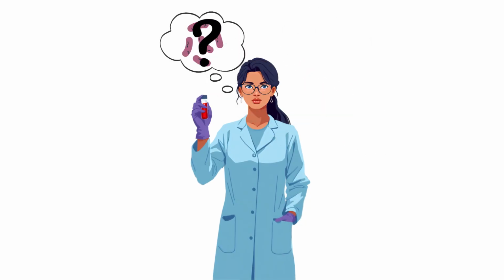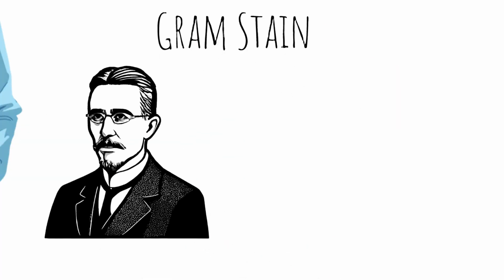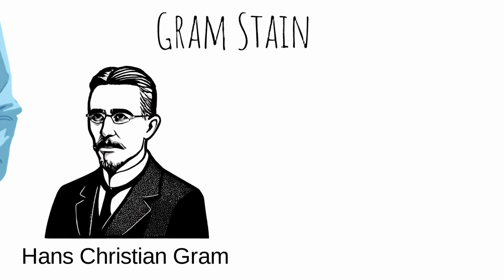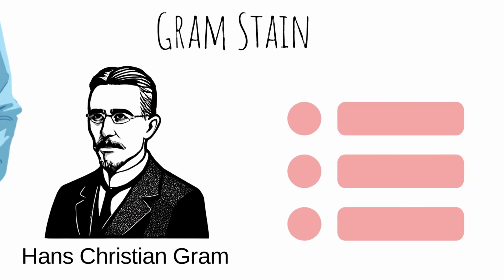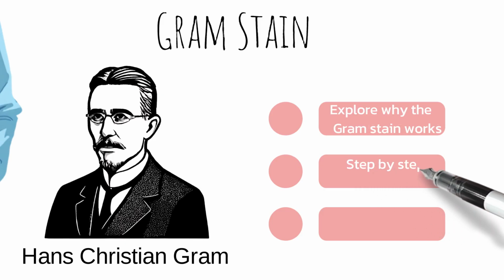One of the first tools you would reach for is the Gram stain, a technique developed by the Danish physician Hans Christian Gram in 1884 and still used in laboratories around the world today. In this video, we will explore the science behind why the Gram stain works, walk through the procedure step by step, and discuss how to avoid the most common errors.